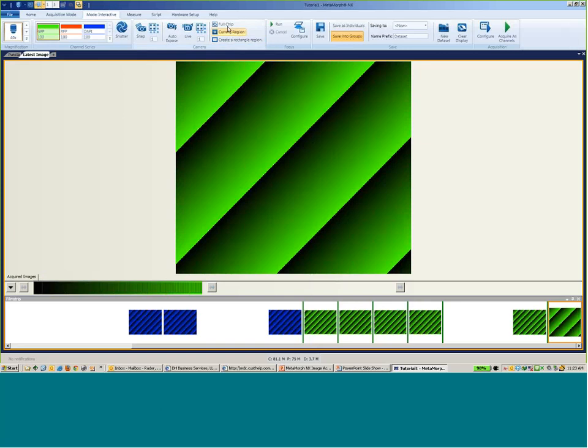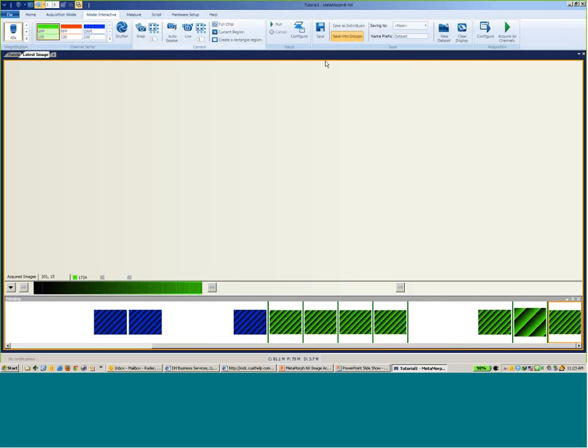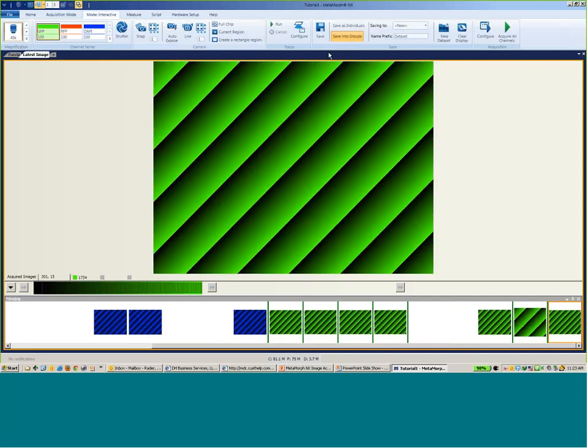It keeps snapping pictures, adjusting the exposure time until it reaches that target intensity. So this is where you would configure the target intensity for doing an auto expose. The auto expose button I use here works off of that target intensity you have configured here. So you may need to adjust that even just to use this auto expose in the ribbon itself.